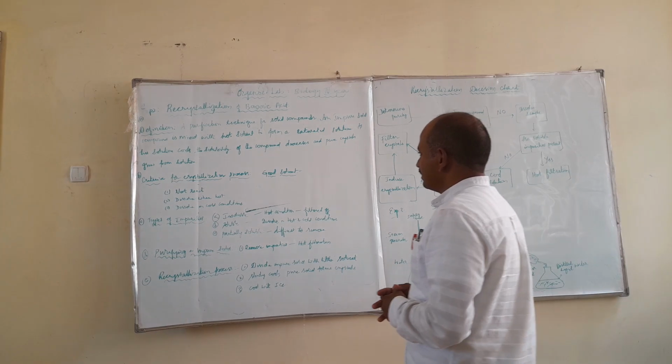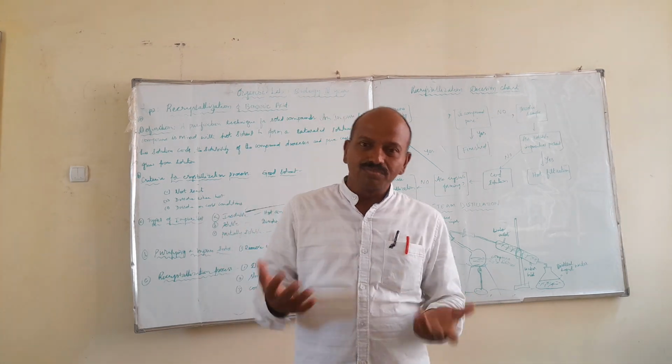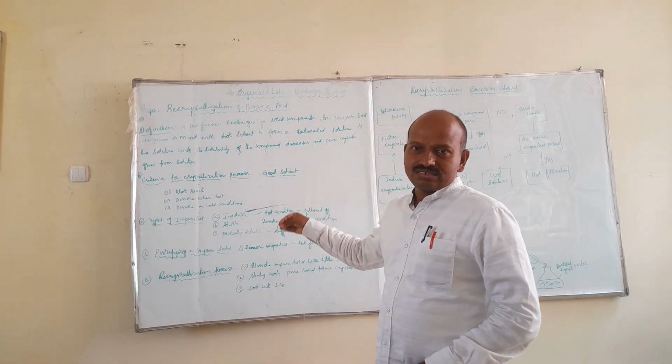Now we can see there is a flow chart here. We can see what to do when it is pure and what to do when it is not pure. We can understand this from the flow chart. This is the short introduction regarding the recrystallization process.